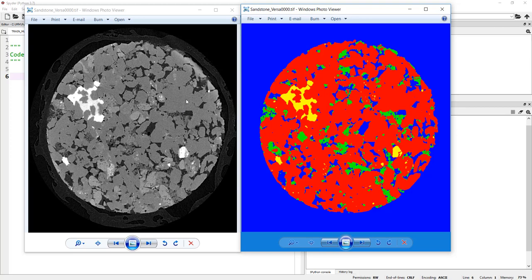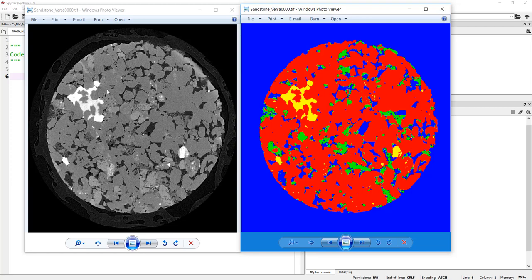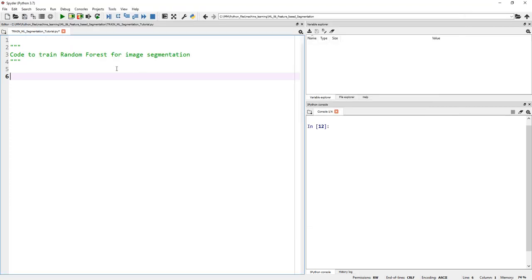The gray levels between these clay materials and other regions are very similar, making segmentation difficult. Also, in CT analysis you see artifacts. This area appears very dense or bright, which results in shadowing. That can be painful if you try to segment any other way. For this, machine learning is very promising. That's the reason I'm using this. So this is the context. Let's go ahead and start writing the code.